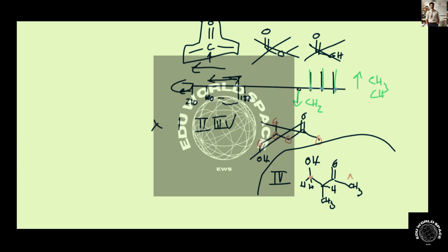that if we call this A, B, and C, that C is going to be the furthest upfield, being the furthest from the carbonyl, whereas B and A are going to be the 2 that are further downfield, and D, let's call it, the one that's pointing downward, right? It's right in the range where you would expect a carbon that's bound to either an OH or an ether. Okay, so 4 is our best bet.